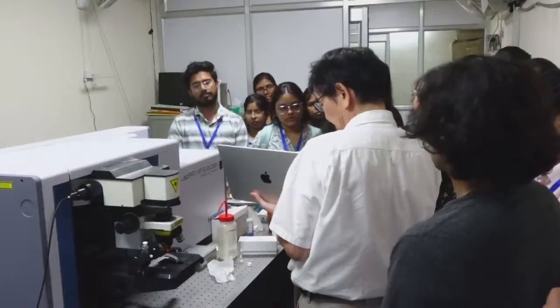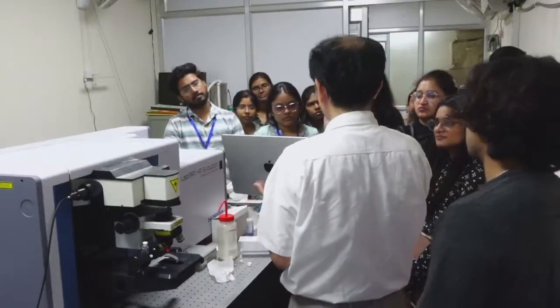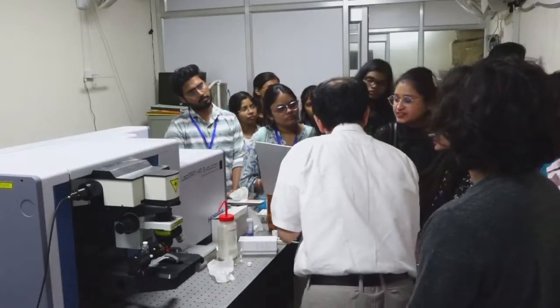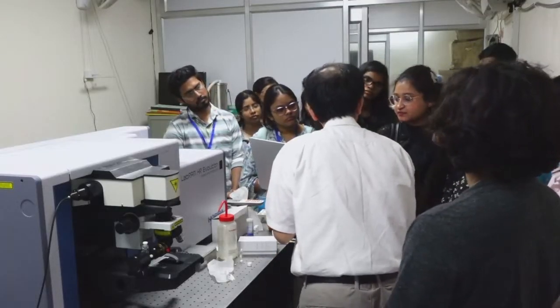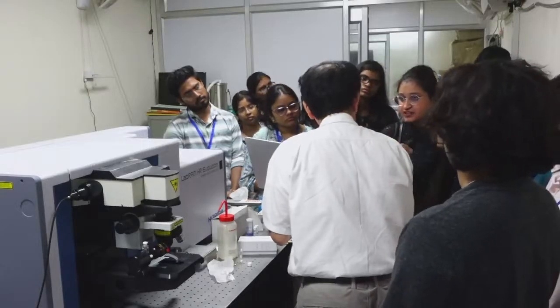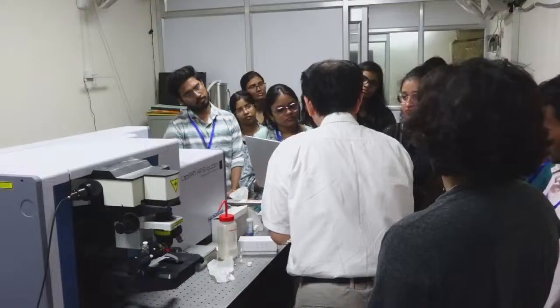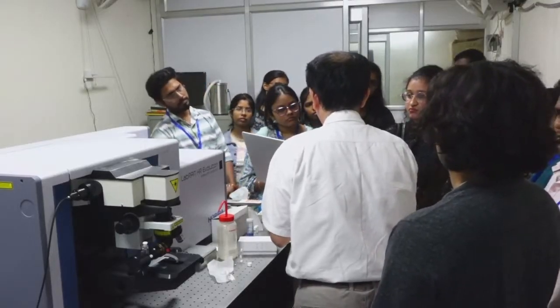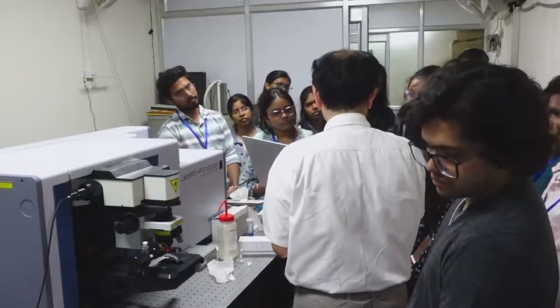Okay. Is there any question? So, in order to decrease the noise, we need to increase the acquisition time and decrease the accumulation time. Just a moment. Partly, yes.